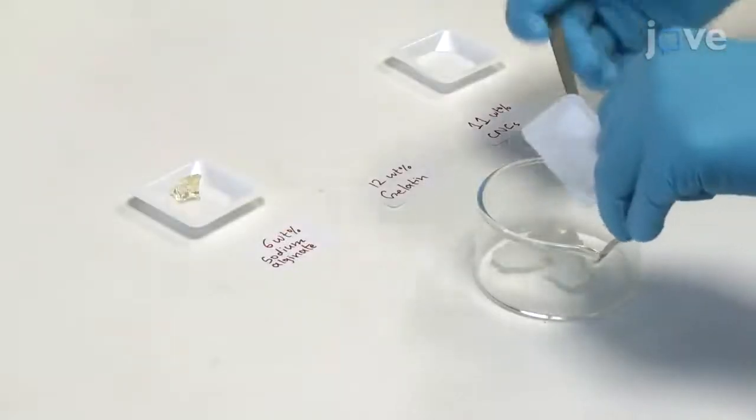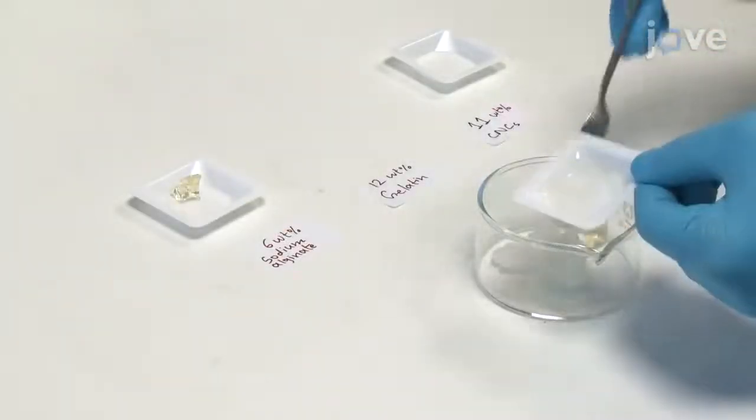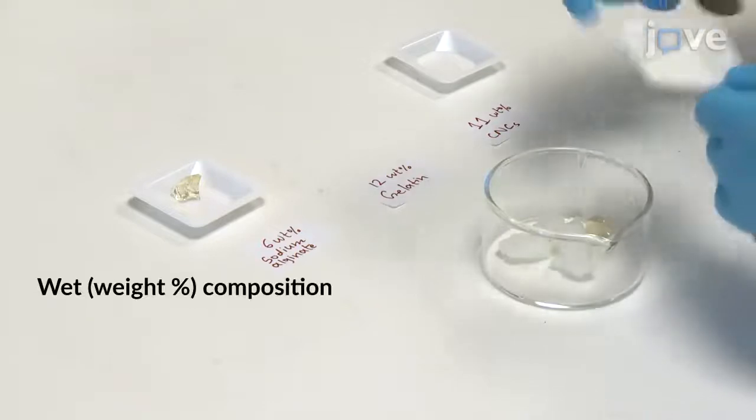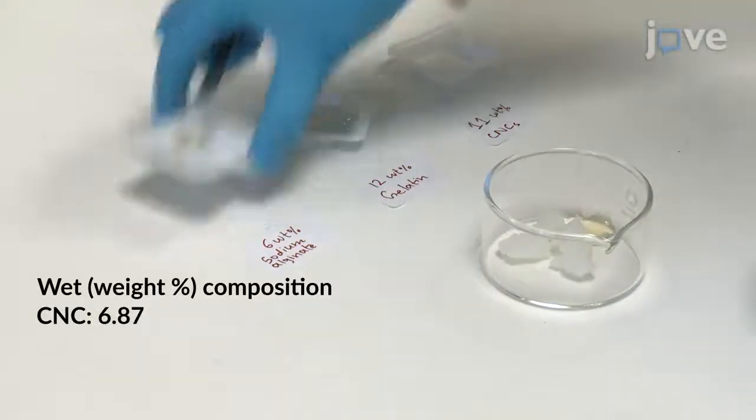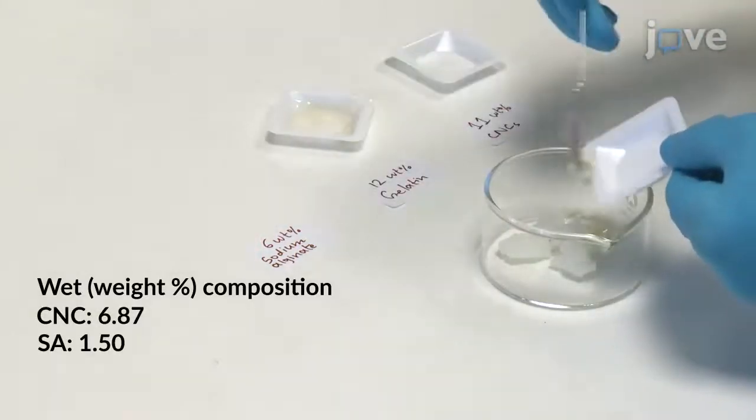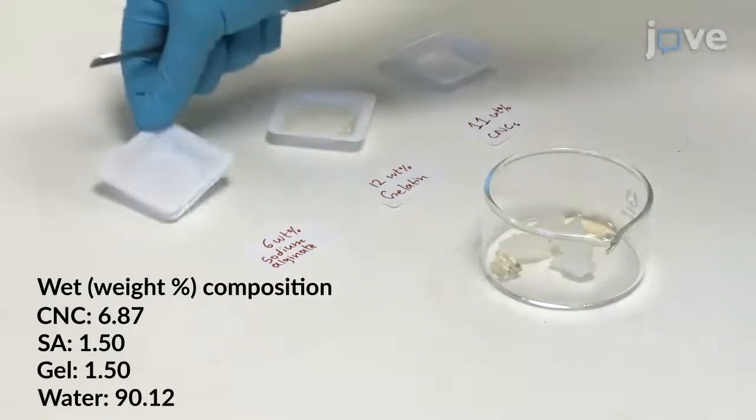To begin, prepare 40 mL of hydrogel ink by mixing 11% by weight CNC, 6% by weight sodium alginate, and 12% by weight gelatin in a container.